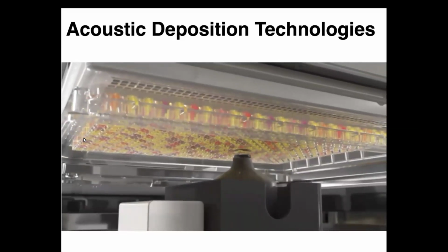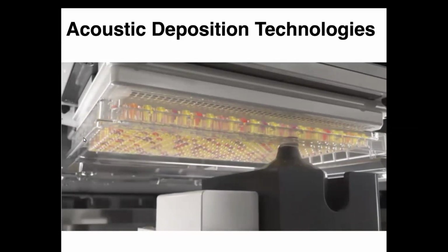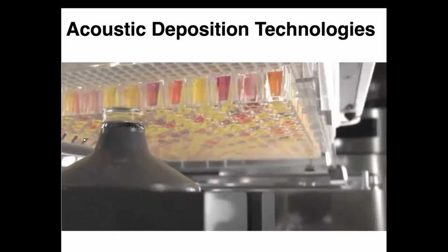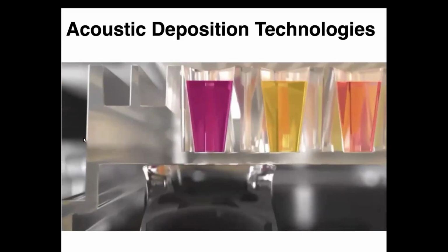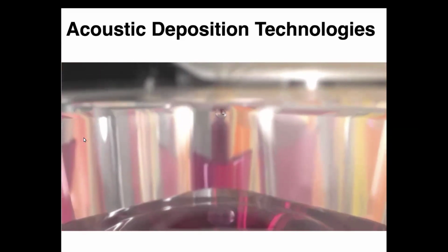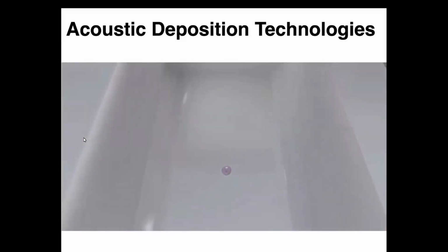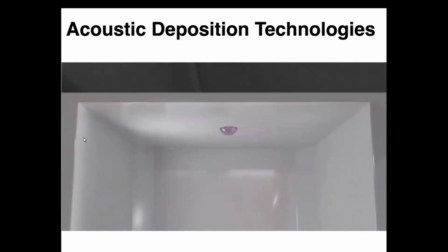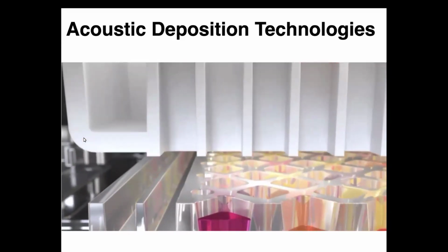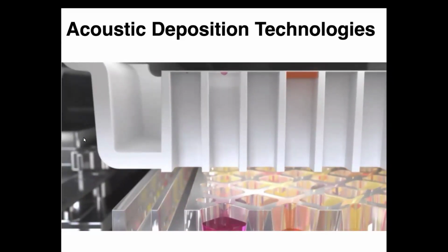So those little droplets that you're seeing typically have 5 to 20 millimolar concentration of a particular molecule inside of there. And they're typically on the scale of nanoliter size droplets. So these little droplets that are being shot into the 384 well plate are being deposited into that plate, which we then dilute further and create a less concentrated version of that particular sample, which allows it to become more mass spec friendly or LCMS friendly.